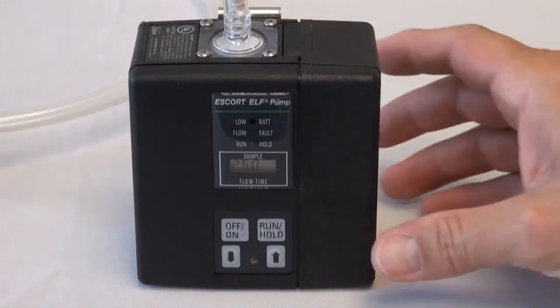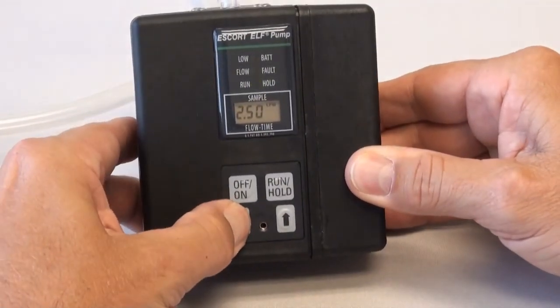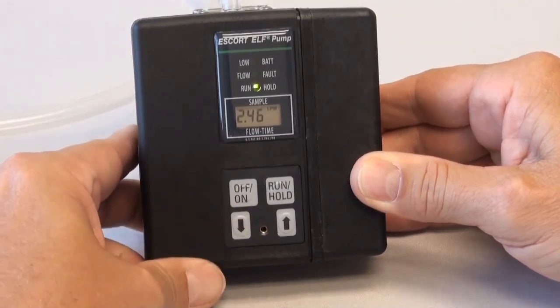Now we will adjust the pump by using the flow rate control buttons. After the pump is set to match the calibrator, turn the pump off. The Escort Elf is now calibrated.